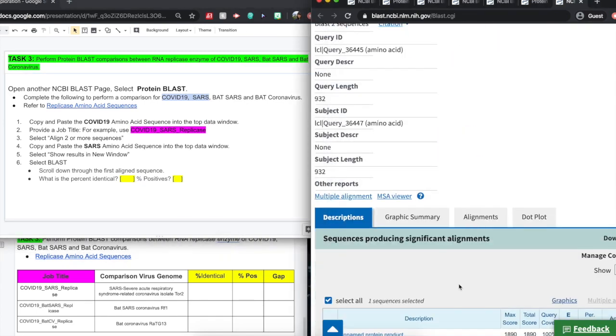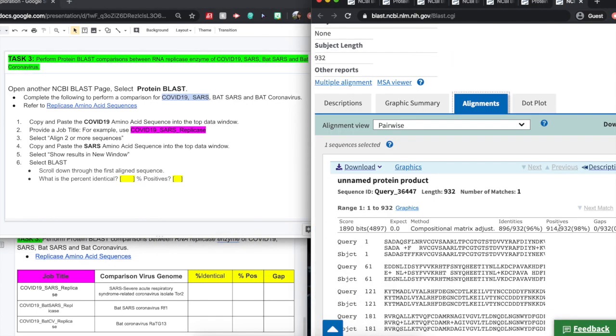And we'll click BLAST. We'll select the alignment. And here we have our identity, our percent identical, positive matches, as well as our gaps.